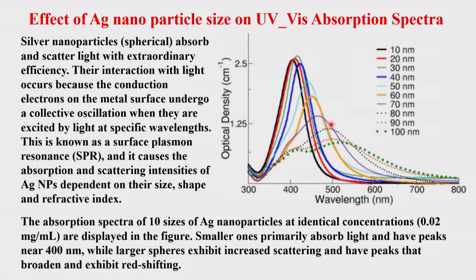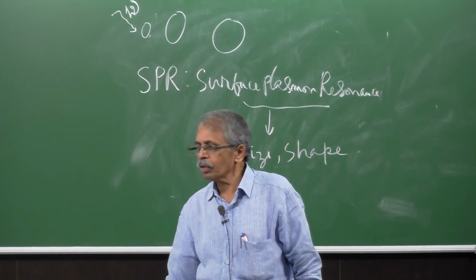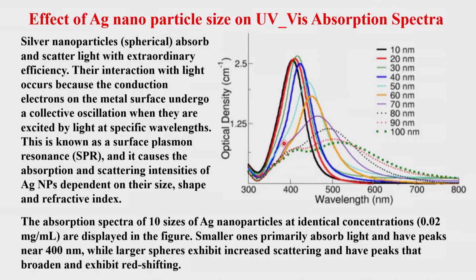If you go to this one, which is 80 nanometers, there is a strong band of this and a little bit weaker of this. And if you go to this one, which is around 70 nanometer, you can clearly see this band. That means at least two different shapes or sizes of these nanoparticles are present in those. Here also you can start seeing a little bend and then another. One is coming from this region around 400, the other from above 550. So there is a smaller one, and as you increase, the shapes are also affected.